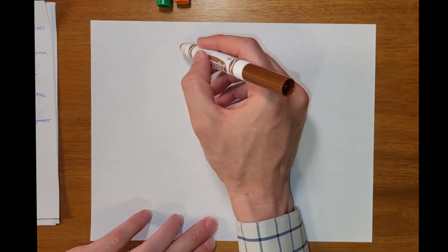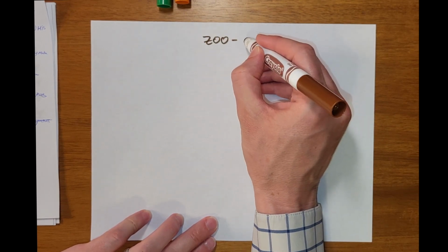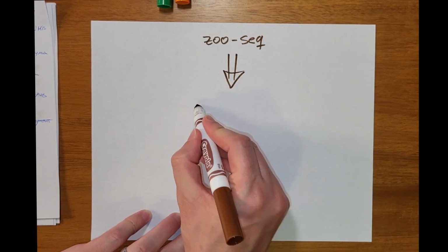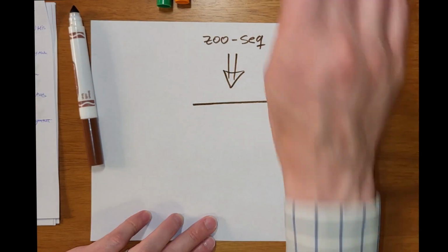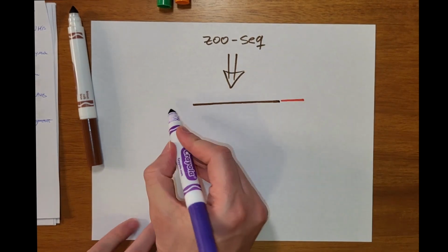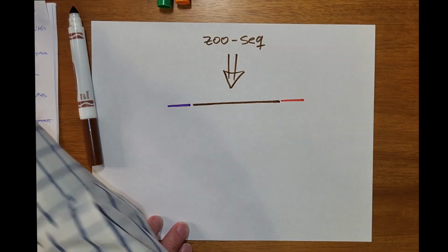So you will start with, there is here a zoo of sequencing techniques, but at the end of the day, all of these will give you a piece of nucleic acid, DNA, to which you will have attached these primers that are custom sequences designed by Illumina. And so this is the basic.